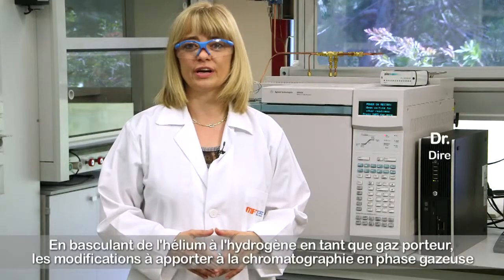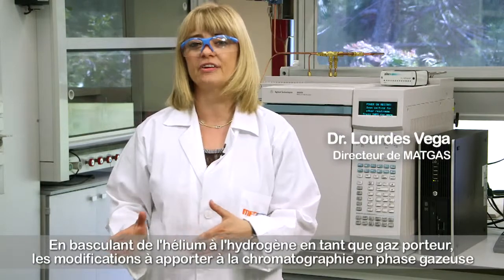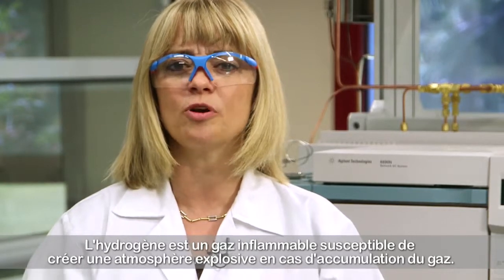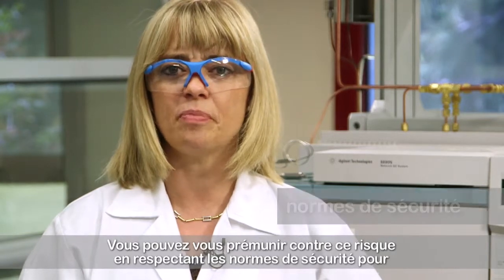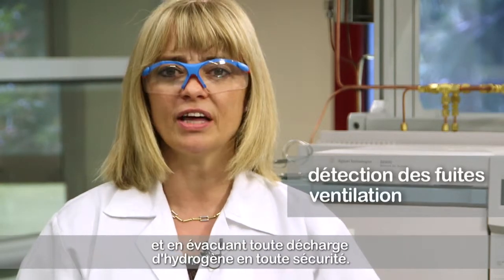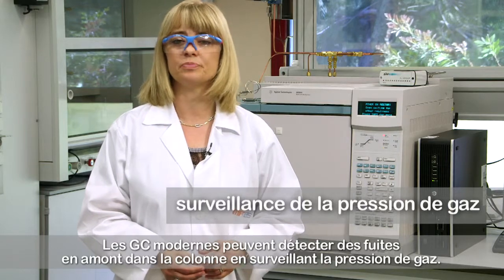The modifications required to the gas chromatograph when switching from helium to hydrogen as a carrier gas are related to the hazards of hydrogen. Hydrogen is a flammable gas that can create an explosive atmosphere wherever it accumulates. This can be properly addressed by safety standards ensuring no hydrogen accumulation is possible by avoiding and detecting any leak and safely venting any outlet stream. Modern GCs are able to detect leaks upstream the column by monitoring gas pressure.